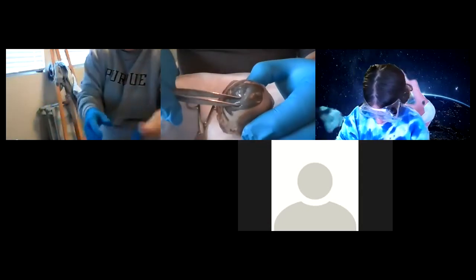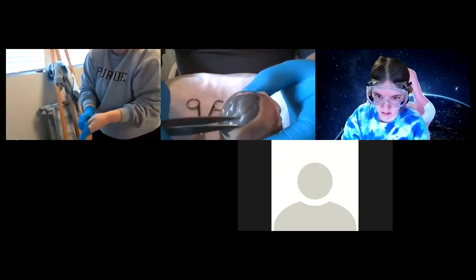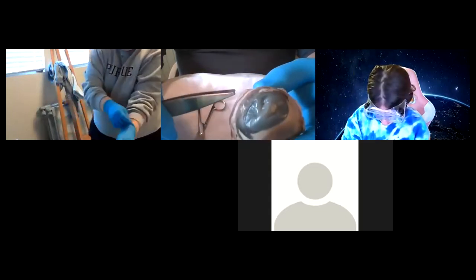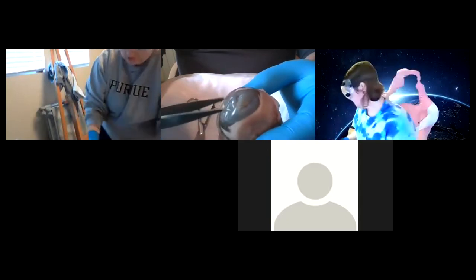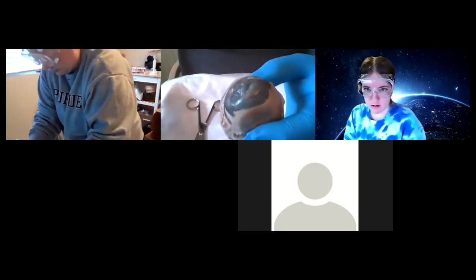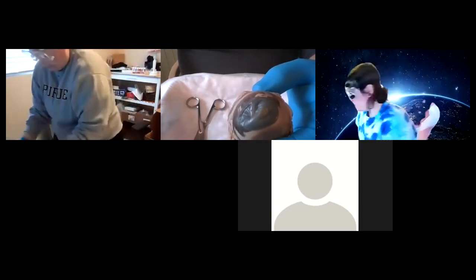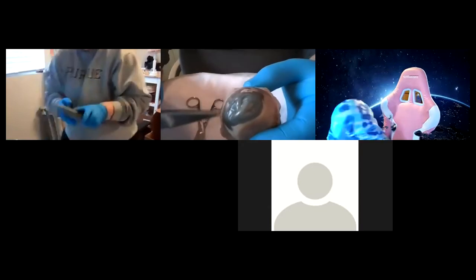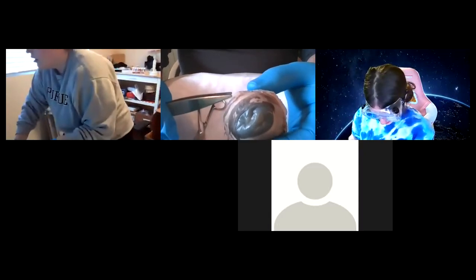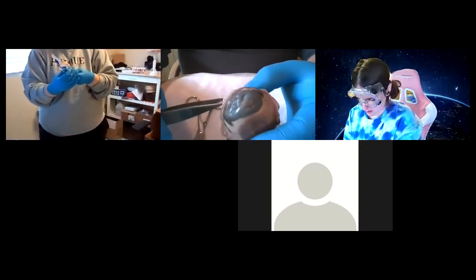The cornea is the outer layer right here. It's transparent, but this is a dead cow eye, so it looks opaque — normally this is transparent. This is part of the fibrous layer. The fibrous layer includes the sclera and the cornea. The cornea is anterior. Behind the cornea is the anterior chamber, which contains a fluid called aqueous humor. 'Humor,' spelled H-U-M-O-R, is another name for body fluids. There's aqueous humor in front of the lens, behind the cornea. And behind the lens, you have what's called vitreous humor, which is viscous and gelatinous, which you'll see when you cut into the eyeball itself.